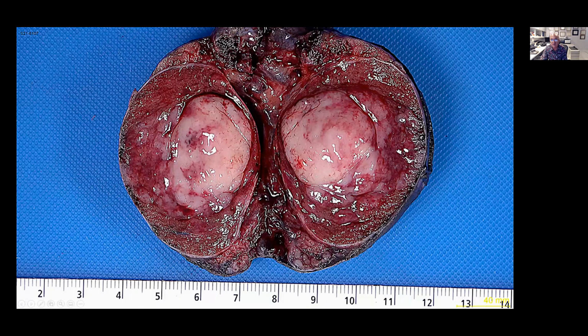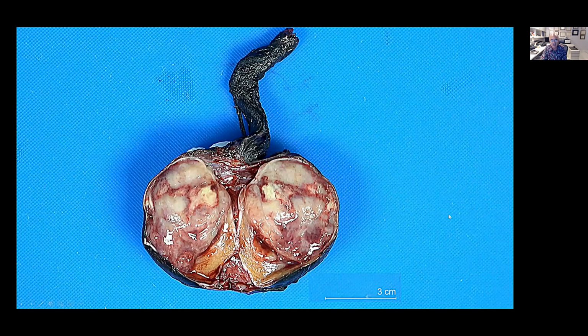Here we have another tumor, also most likely a seminoma, very well circumscribed, and the relationship with the other structures needs to be documented in the gross examination. Here we have another case where the surface of the cut section is more irregular. This was a mixed germ cell tumor with different components, embryonal carcinoma, seminoma and yolk sac tumor, that was too close for comfort, we say.